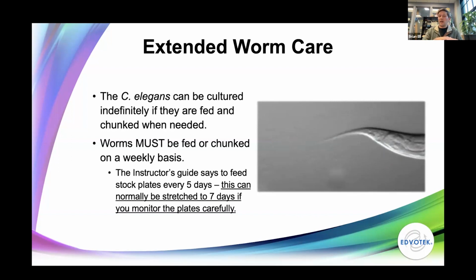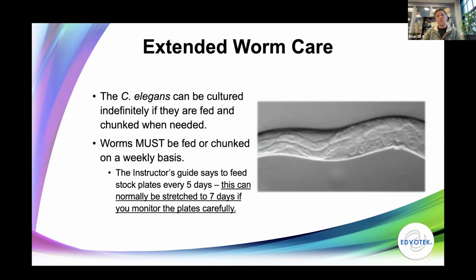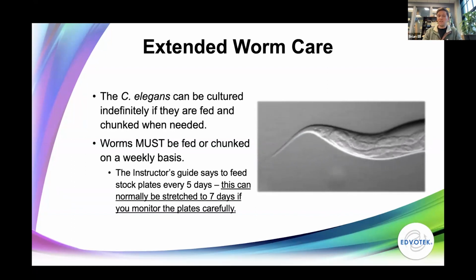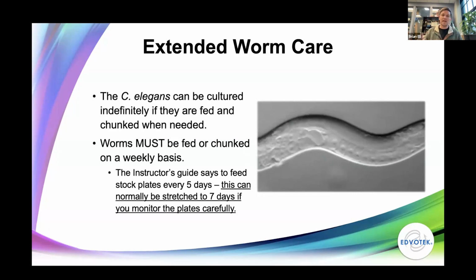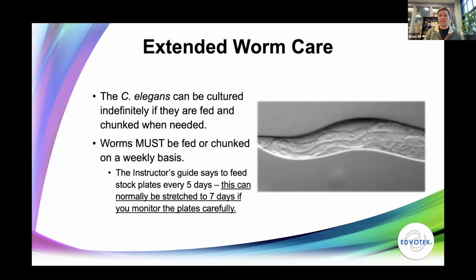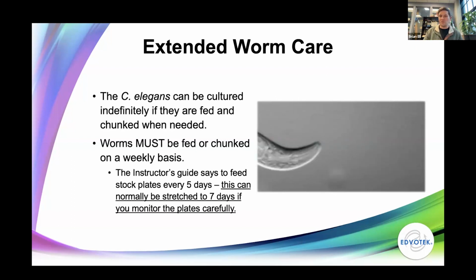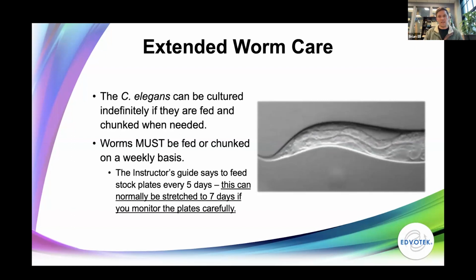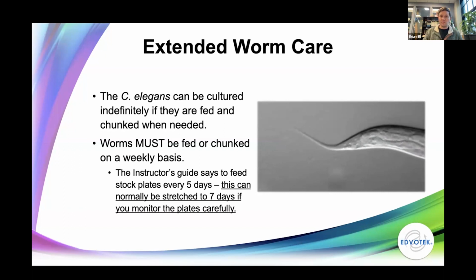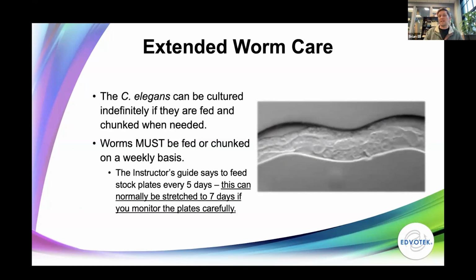When you come back after break, so 2 weeks is kind of the longest we'd want to do this, the worms should be good. You'll want to feed them immediately and then chunk them the following day. So we want to try to boost these guys and get them going again immediately. They will probably be looking a little bit slow. You might see a couple worms that are no longer moving around, some adult worms that hit the end of their life cycle, but you should have no problem getting them to go for the 2 weeks. Just know that they will take probably about a week to come back again.